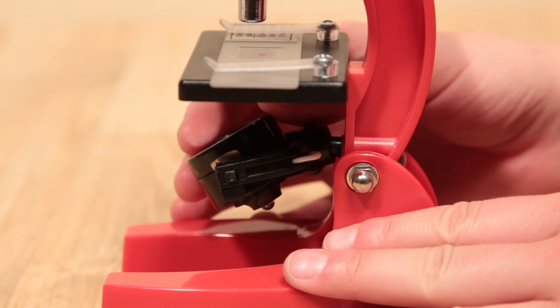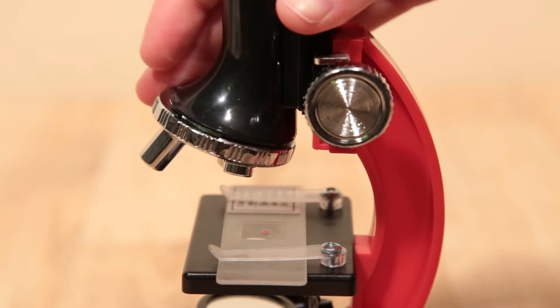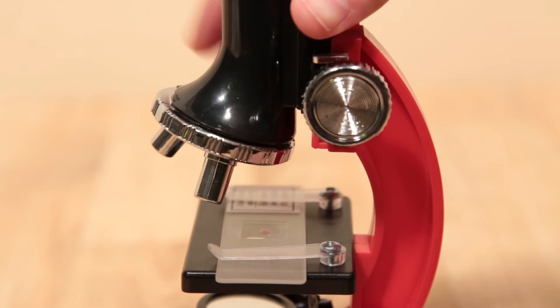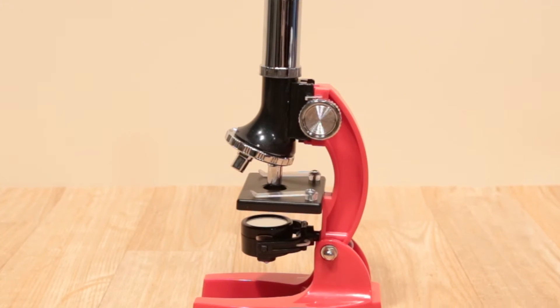If lighting is not available, just use the built-in illuminator. Choose between three lenses: 300 times, 600 times, or 900 times of magnifying power. Adjust the focusing knob and discover the magnificent microscopic world before your very eyes.